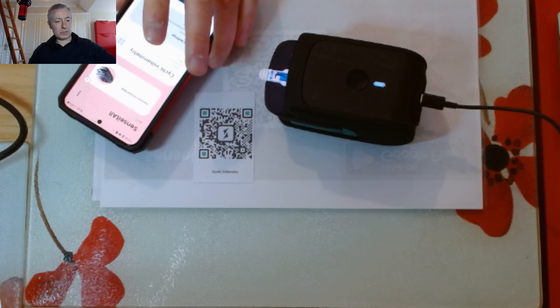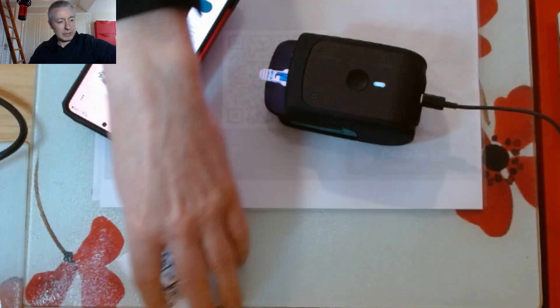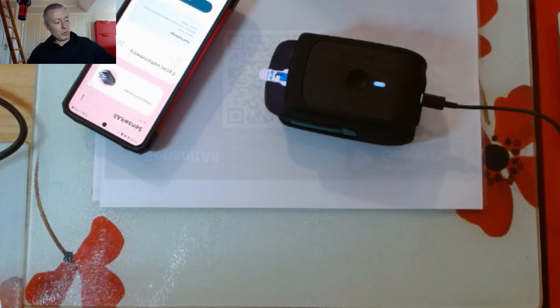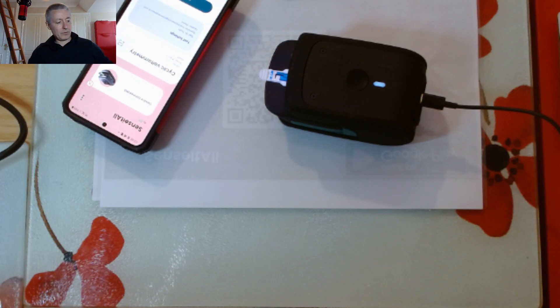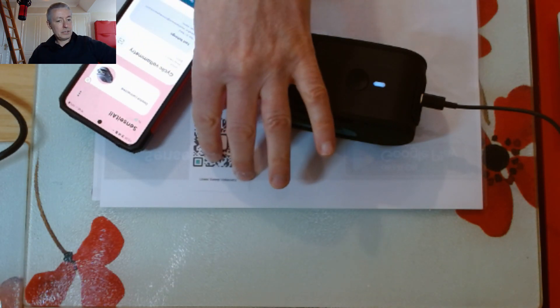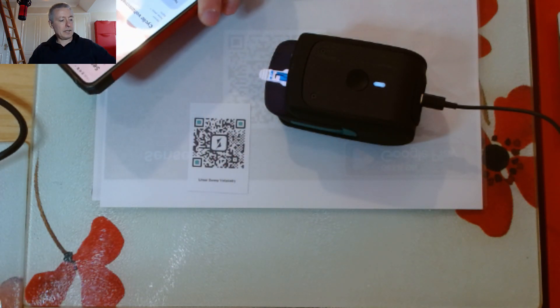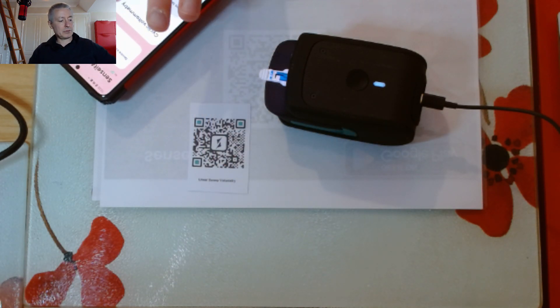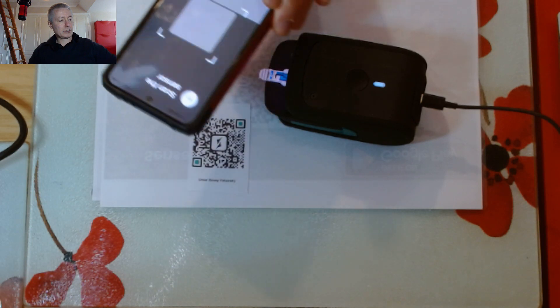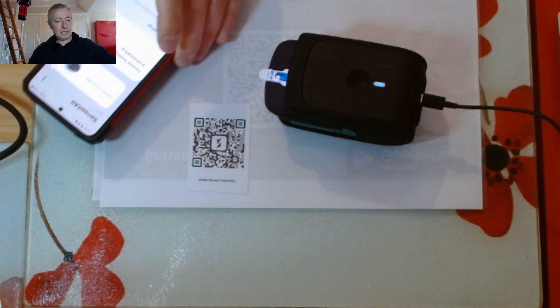We're almost at the end now. If you want to do linear sweep voltammetry, there's a QR code for linear sweep voltammetry. I'll just scan the QR code for that now.